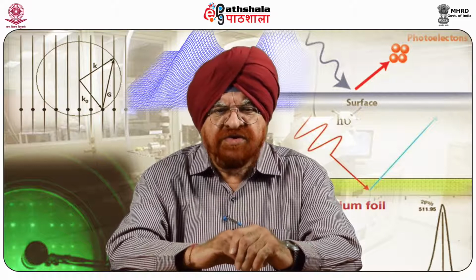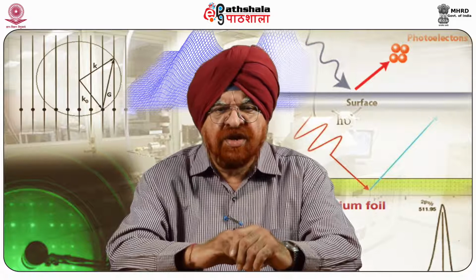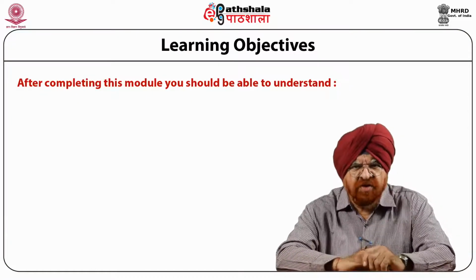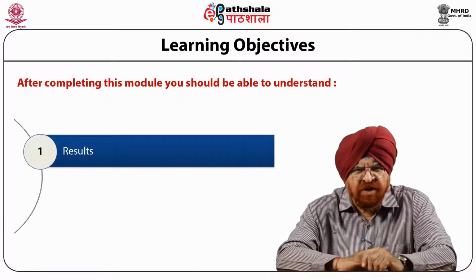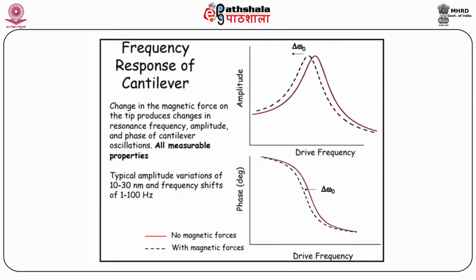Today, we are going to discuss the module Magnetic Force Microscopy, in which we are going to discuss data analysis, and this shall come under the paper of Surface Analytical Techniques, Part 1. When we complete this module, you will be able to understand to a great extent the introduction, then results and conclusions. Frequency response of cantilever.